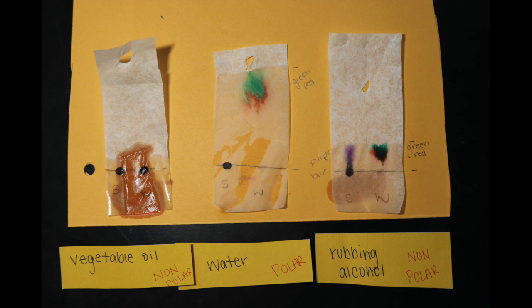that they reached in the last scenario with the rubbing alcohol, because the Sharpie is attracted to the solvent, which is the rubbing alcohol, and the washable marker is very much attracted to the paper. So both of them can be separated. And if we look at it, the Sharpie is separated into blue and purple pigments, and the washable marker is separated into green and red pigments.